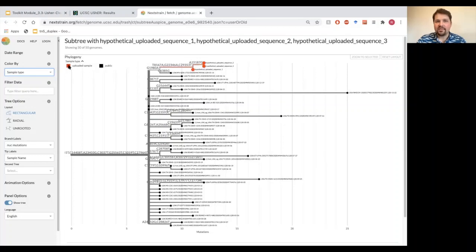So in this case, you can see that our user added samples are 3 that are very closely related to one another. In fact, 2 of them are genetically identical, here and here. And the other sample is very closely related here, suggesting these may constitute a recent set of transmissions within a local community. You can also see that the most closely related sample to these 2 is here. It's a sample from Minnesota, and information about it pops up by hovering over that sample as well.